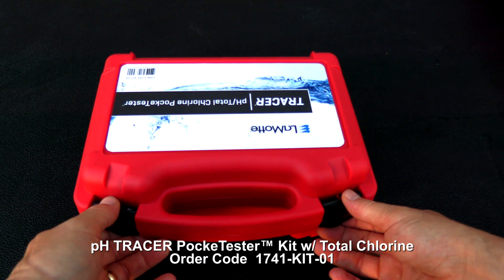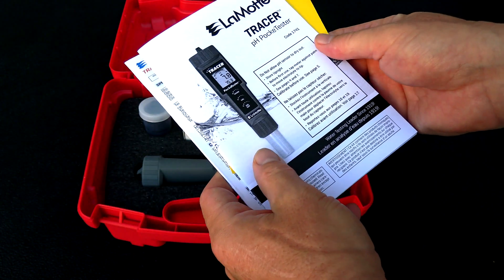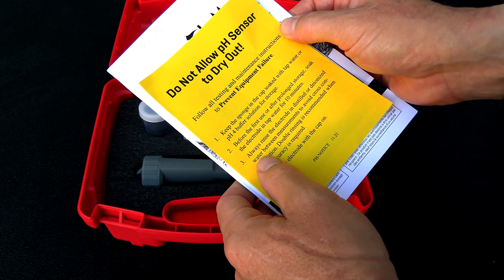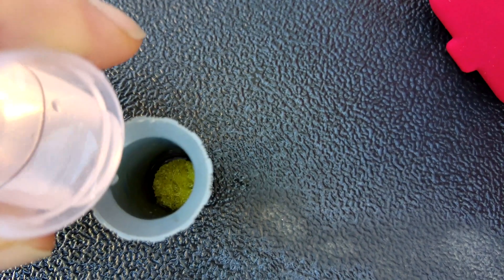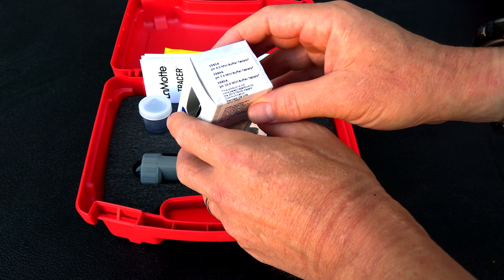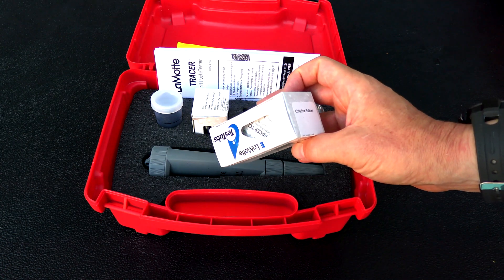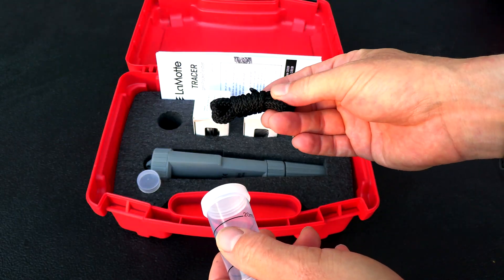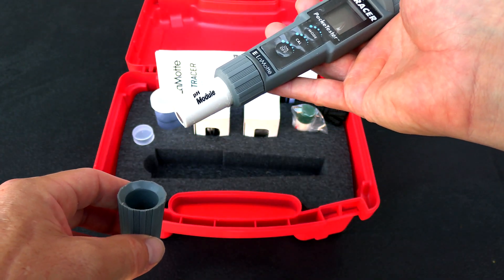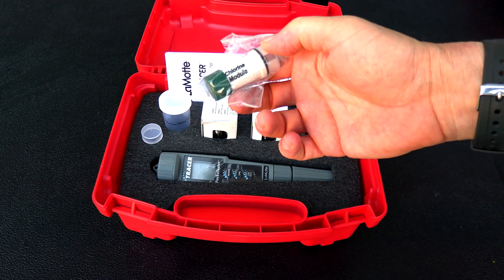The Tracer Pocket Tester comes in a really nice case. Inside, you'll find the instructions for the Total Chlorine Pocket Tester and also for the PH Pocket Tester. There's a warning that you don't want the PH sensor to dry out — the instructions state to store it with a sponge and PH4 solution. Included are three different PH mini buffer tablets: PH4, PH7, and PH10, as well as chlorine tablets for the chlorine test, a lanyard, and a sample cup. The unit is shipped with the PH module attached, and inside you can see a sponge with PH4 solution. Also included is the chlorine module.